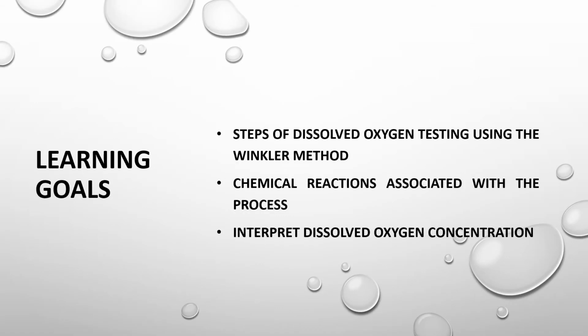You should now understand the steps of dissolved oxygen testing using the Winkler method, be familiarized with the chemical reactions associated with the process, and be able to interpret if the measurement is indicative of a healthy water system.